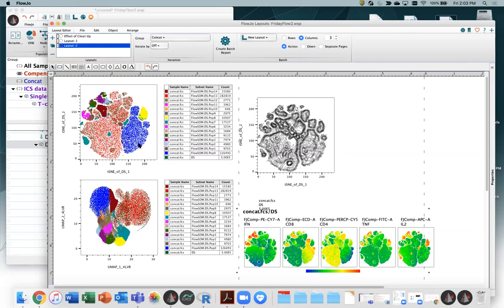And it looks like there's some CD8s in here. Anyway, CD8 is largely negatives, and that's why they stand out as different from the rest, up this way. So again, each of the different types of tools here is telling you something different. Combined, actually, it's nice to get a holistic view. And there's our FlowSOM populations.